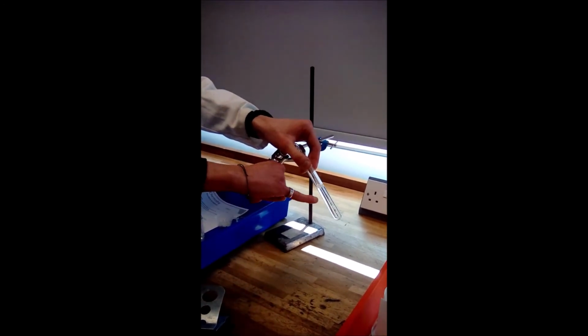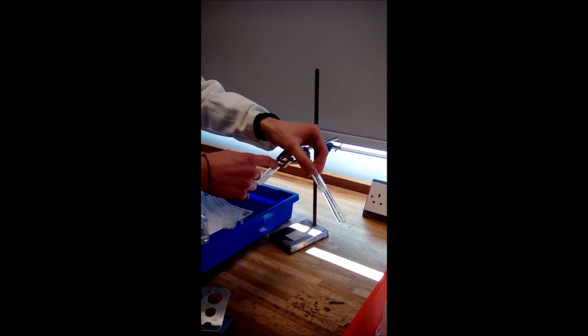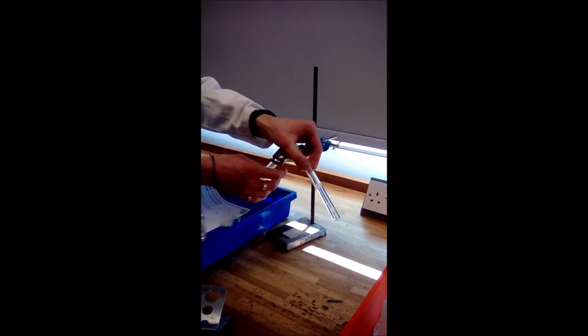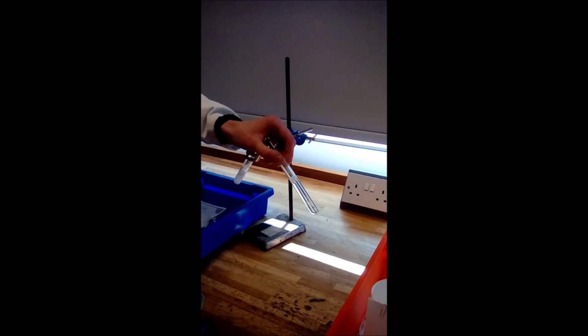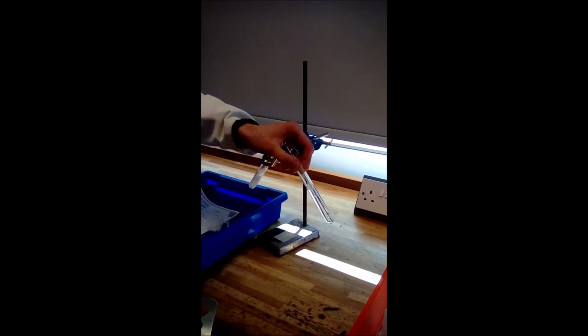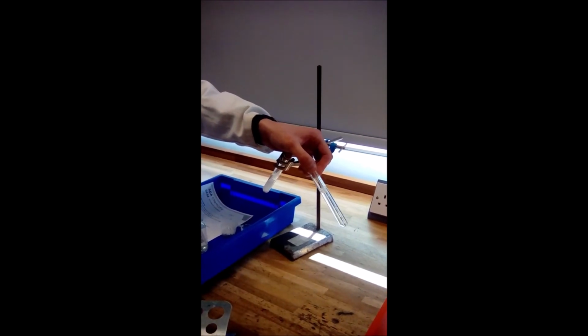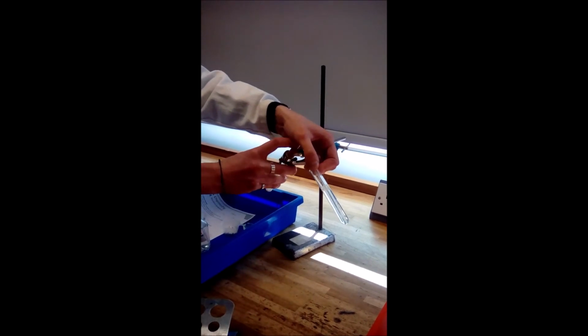So this clear lime water we see here should very soon, once all the air and the oxygen is out, start going cloudy. So if I can get more of my marble chips down into it, we should soon start to see our carbon dioxide once the reaction has pushed all of the oxygen out from the test tube and then the bung and the tube itself.